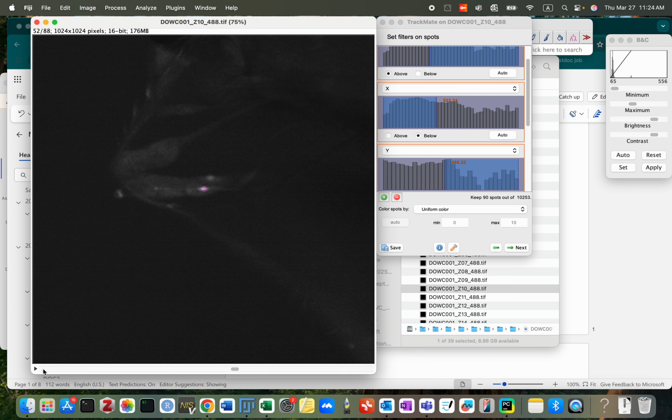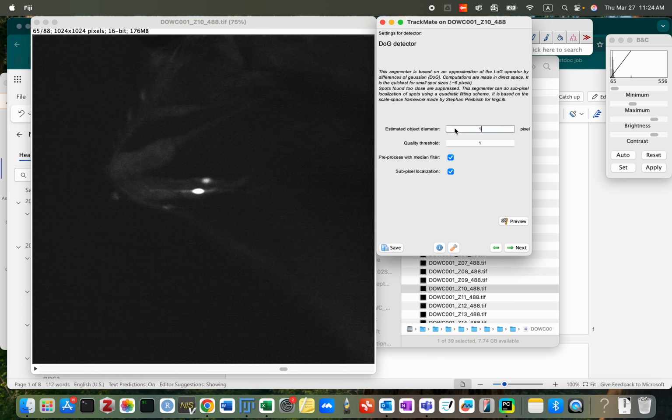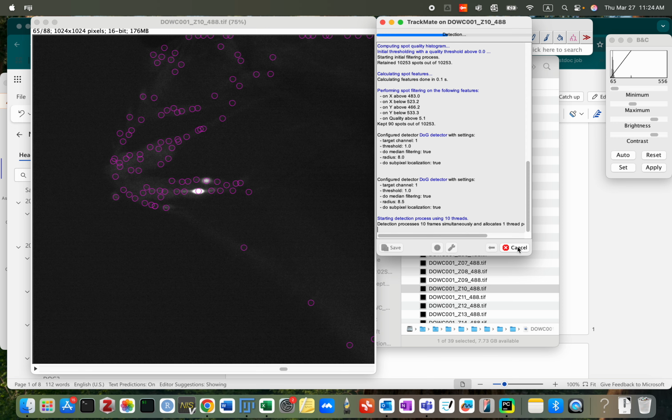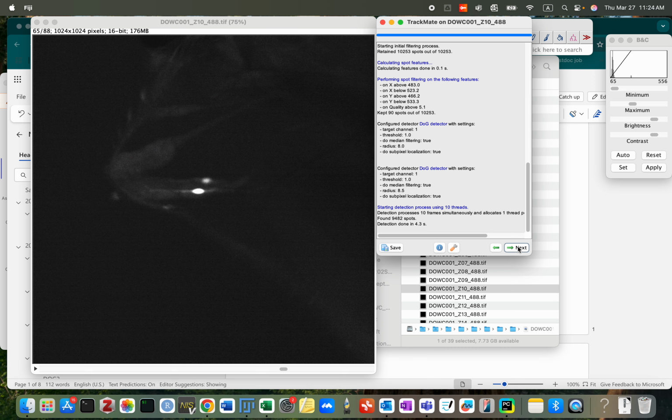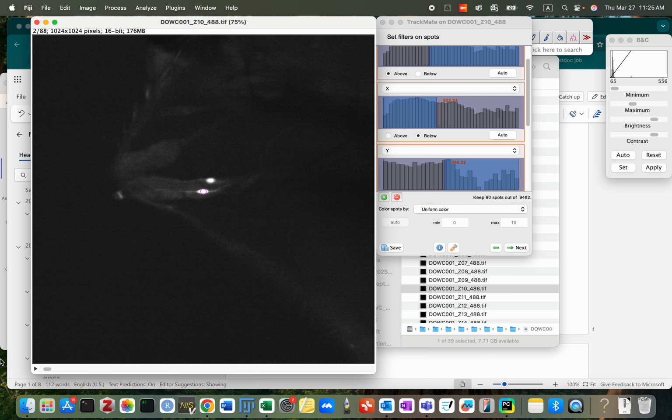Make sure all the time points are selected for neuron 1. Okay, at this point I think 16 is a bit small. I was wrong. So I want to correct this to 17. Okay. Let's check it again. Good.